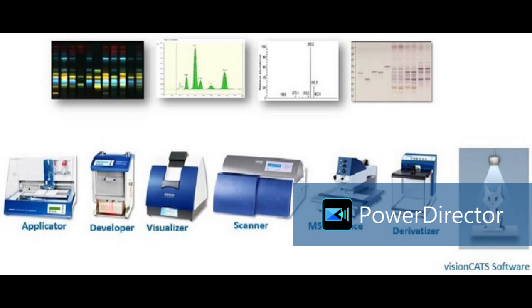Yeah, this is modular only, but it's connected. This is a conveyor belt type of assembly. And ma'am, this is mainly for QC labs and bigger labs where methods are well set. It is a high sample throughput method, for checking batch-to-batch consistency, constant work. For R&D it is not that beneficial. High sample throughput is not needed in R&D, there is no fixed method. Changing the sample and solvent every time is time consuming.